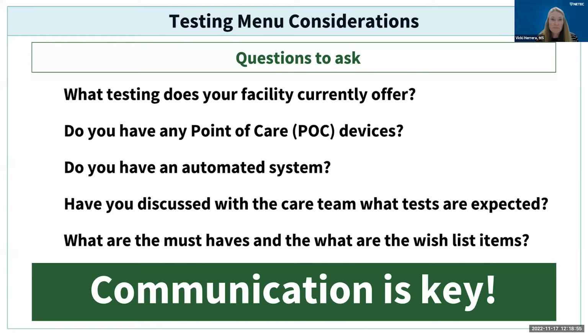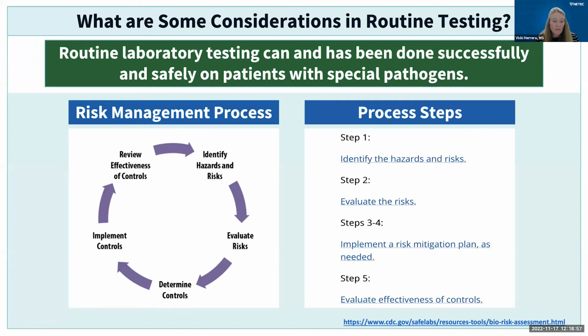Next slide, please. And first, I want to reassure you that routine laboratory testing can and has been done successfully and safely on patients with special pathogens. However, these specimens should be treated with caution and safety measures should be taken in order to keep you and your laboratory staff safe.